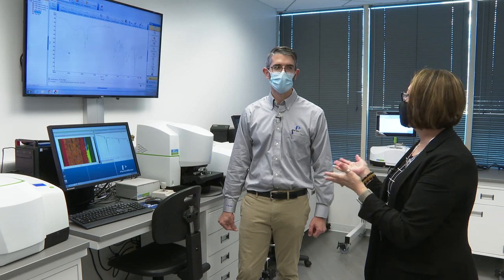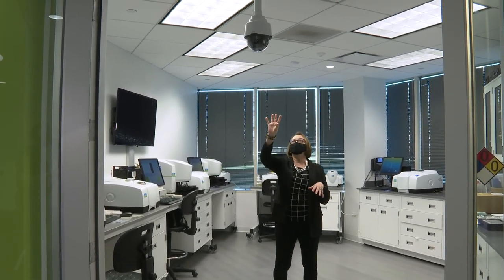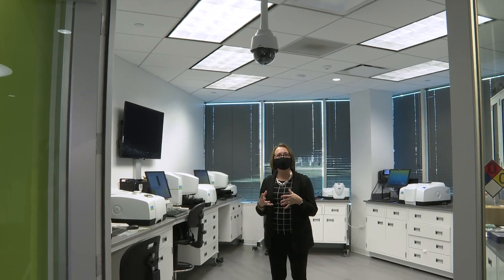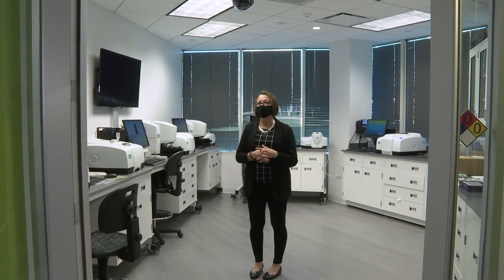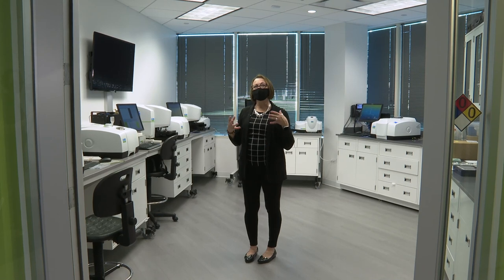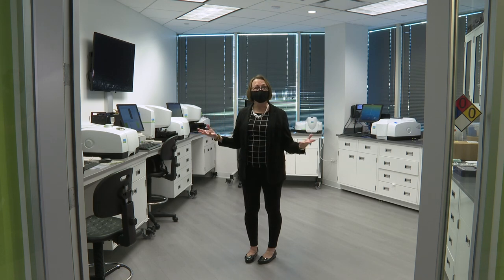Thank you Ryan. One of the other things I wanted to mention: as you can see we have a camera in this lab. All the labs you saw today have a similar camera which actually allows us to virtually give demonstrations. So customers who in this pandemic don't want to travel but want to see equipment and get demonstrations — we can actually give a virtual demonstration of any of the instruments you saw here today, thanks to these cameras in our labs.